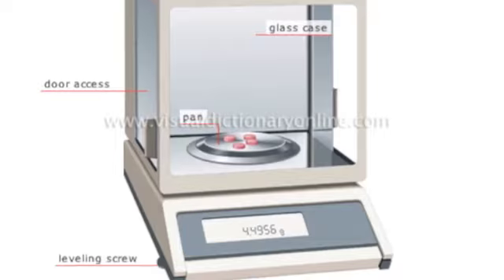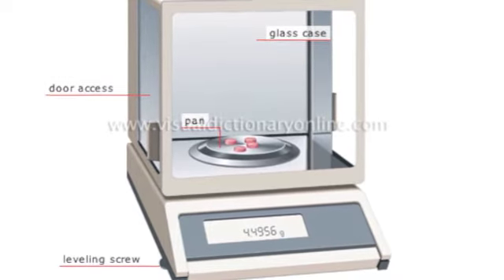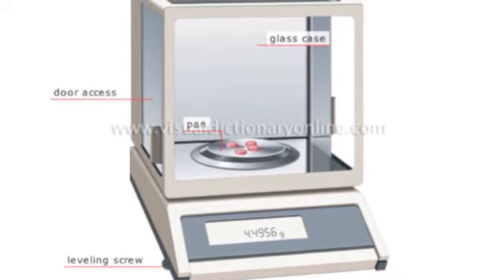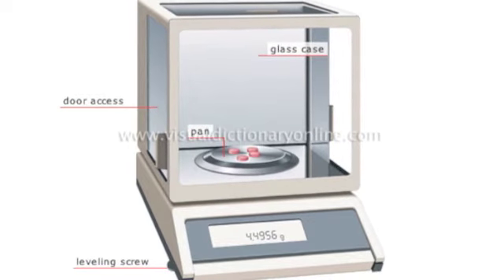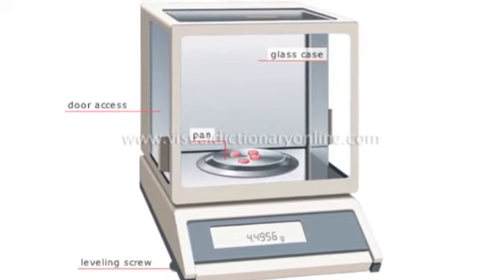The next step is to standardize the NaOH. Weigh approximately 0.4 grams of KHP into a weighing boat using the analytical balance for exact precision. Then the KHP needs to be dissolved into about 75 milliliters of deionized water in a 250 milliliter Erlenmeyer flask. 3 drops of phenolphthalein should then be added. The initial volume should be recorded at this point.